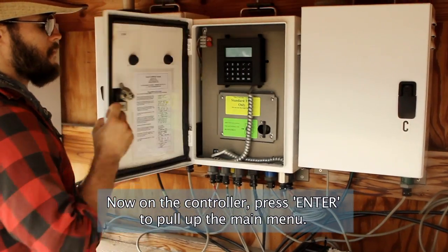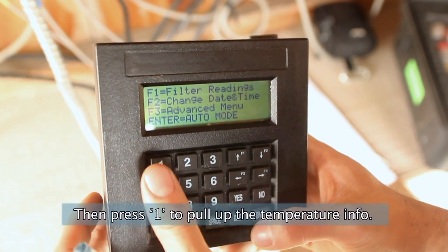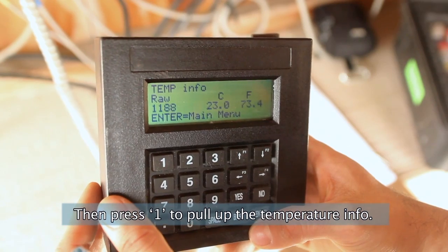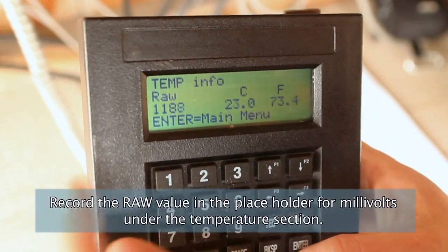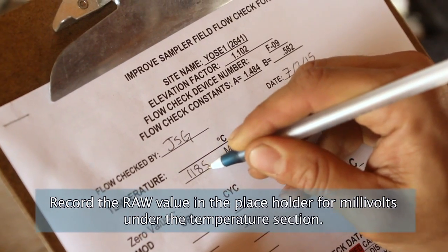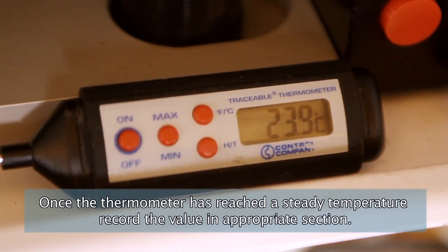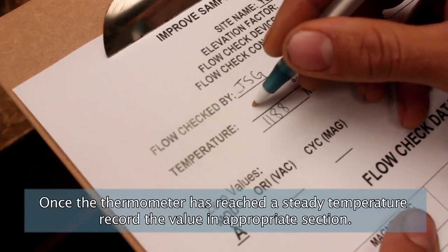Now on the controller, press Enter to pull up the main menu. Then press 1 to pull up the temperature info. Record the raw value in the placeholder for millivolts under the temperature section. Once the thermometer has reached a steady temperature, record the value in the appropriate section.